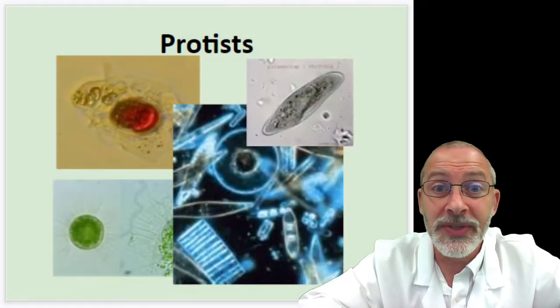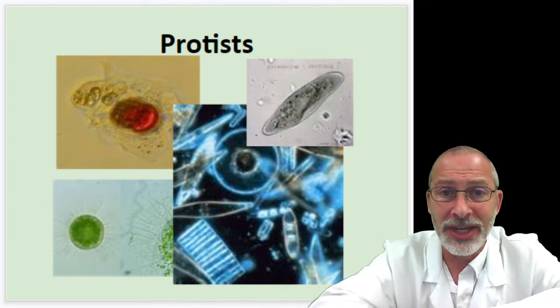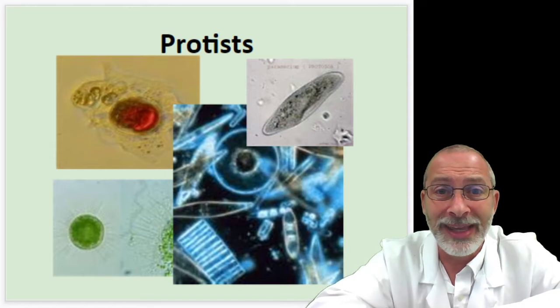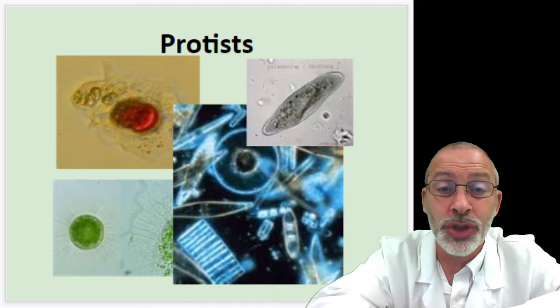Otherwise, I have the microscope and the slides all ready to go. All right, our lab activity today is entitled Protists, and let's look at the problem of this lab before we begin. Remember that we have been talking about protists throughout this week, some pretty cool unicellular critters, and we're going to be examining some of these things under magnification today.